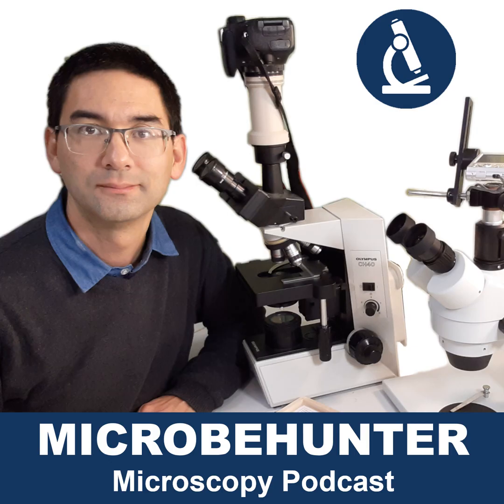Okay, so that's basically the three reasons, which I'm going to summarize again. The first one is that some structures and features are difficult to see because they have a low resolution. They're way below, the features don't have a low resolution. The microscope's resolution is not enough to make those features visible. That is the correct way of actually saying it. Then they have low color contrast. And then also the same refractive index as the surrounding medium. And if you have enough color contrast, then you're able to see it, and then the refractive index can be the same. And if this is not possible, then you must make sure that somehow the specimen has a somewhat different refractive index than the surrounding medium.